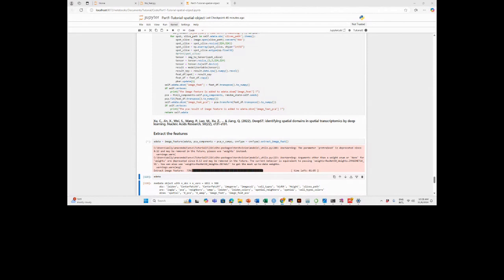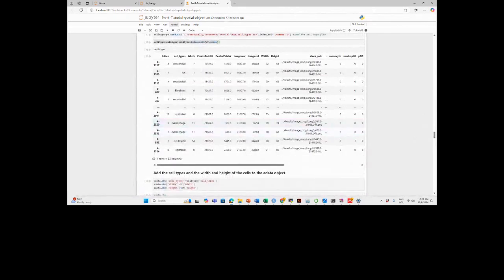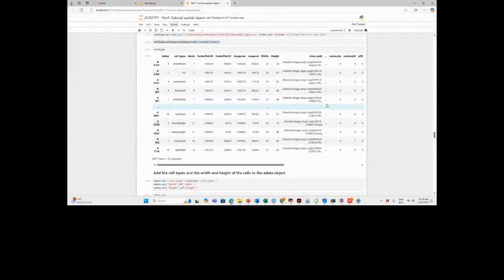Go ahead, Kat. Yes. So basically, you will see that information also in the gene expression matrix. You don't really need to go to the image, but you can do that because, as we saw in the beginning in the slides, there is an approximation, and you need to consider this. The way Carla did it is, once you have the center of the cell after doing the segmentation using the transcription data set, you can identify the center of the cell. And from that center, then you can go into the morphological image, locate the same center, the position, and look around that center. How many pixels around the center did you use, Carla?